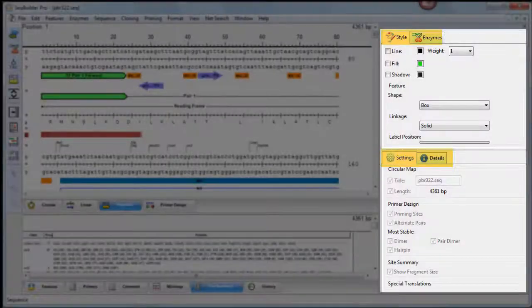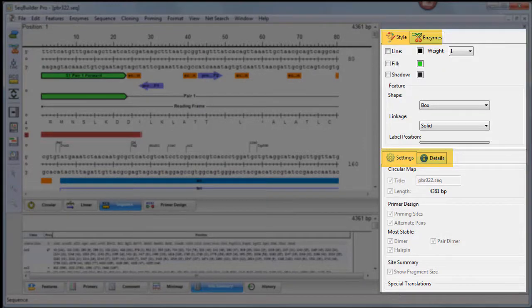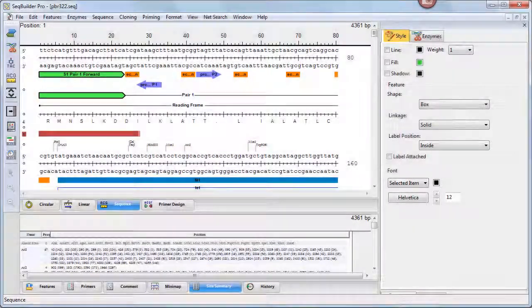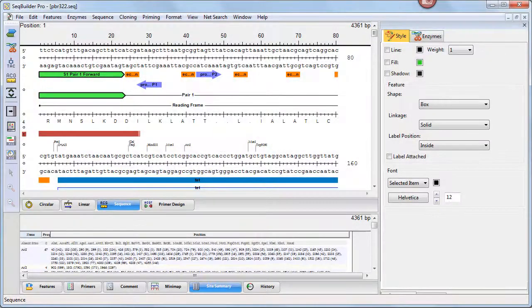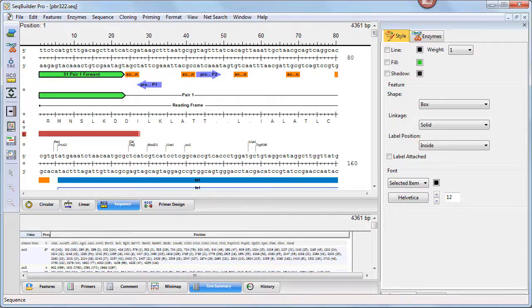On the right are four new panels, each accessible by clicking on the corresponding tab. The Style panel provides the ability to change the appearance of the currently selected item, a feature, enzyme, or sequence, in the document window views.